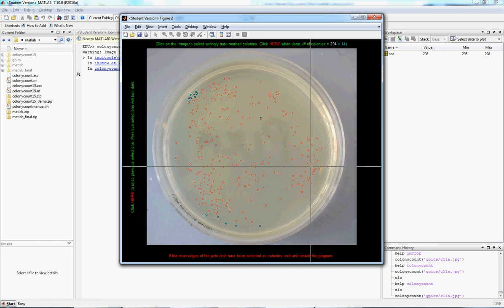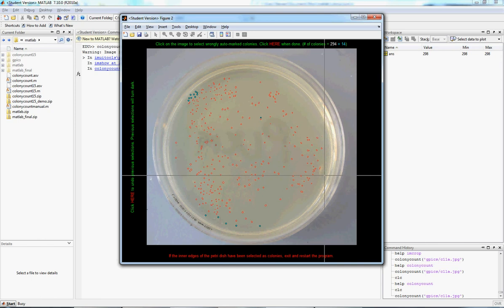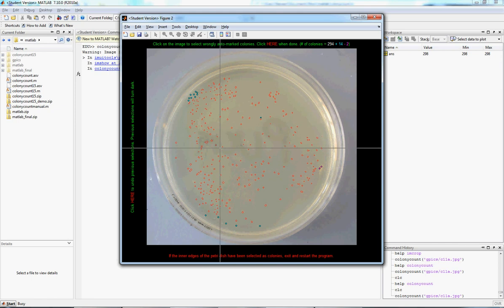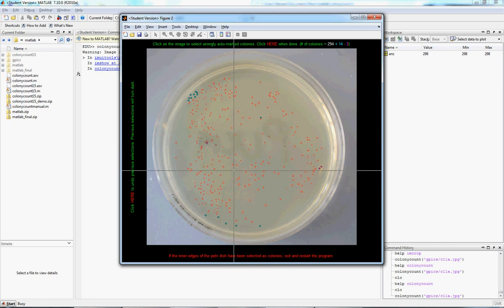And now, we can click the colonies that were wrongly marked. So over here, it's just a smudge, so we can count that as wrong. This looks like some junk.